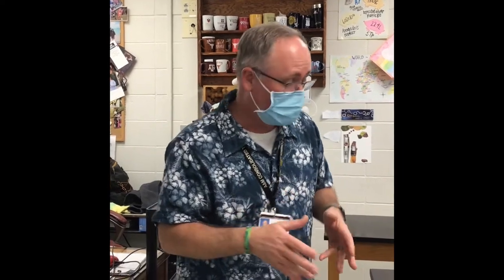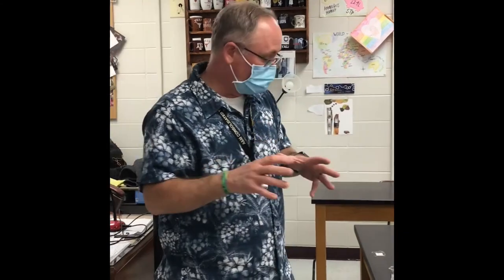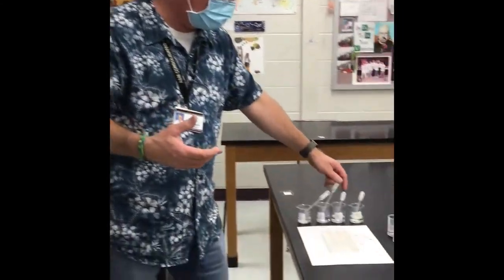There should be a directions slide that you need to open up and look and see what you have. You're going to have 4 different concentrations of acid and 4 different concentrations of base. Both of them are strong. You're going to have 0.1 molar, 0.2 molar, 0.4 molar, and 0.8 molar hydrochloric acid, and 0.1, 0.2, 0.4, and also 0.8 molar sodium hydroxide. They are randomly assigned letters of A, B, C, D, E, F, G, H.